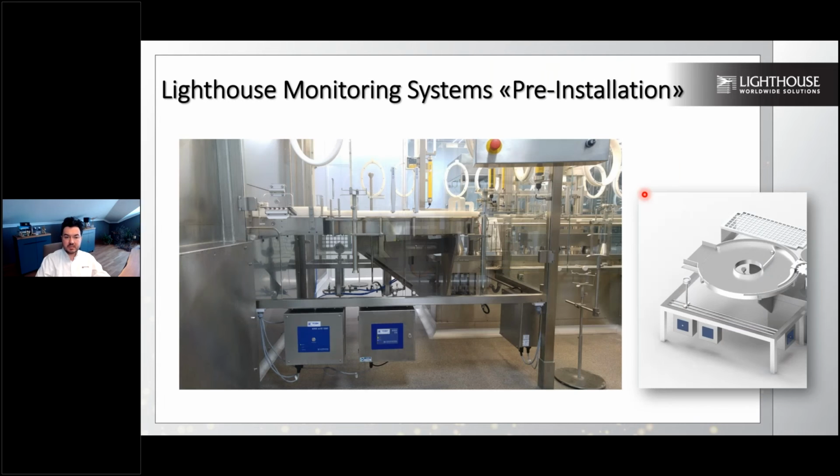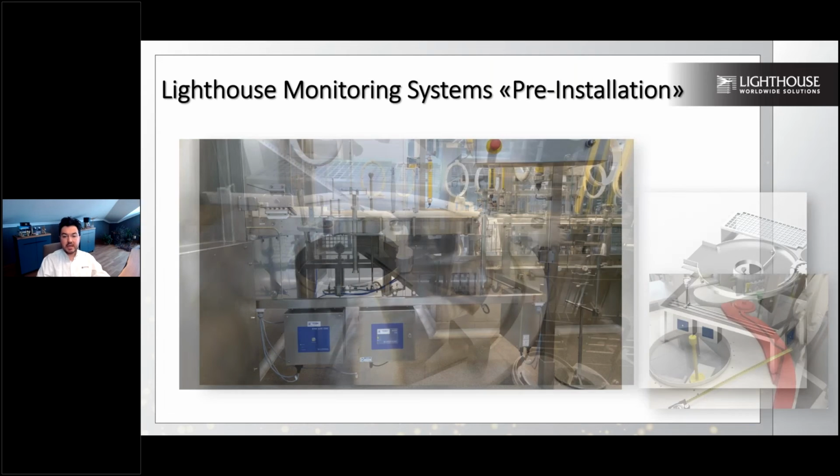So take a look at this location again. I have this microbiological sampling head on my right, so that the operator can easily access it with these two ports. And I have my particle counter here, where I will be able to collect all the risk locations on my turntable within a 30 centimeter distance.